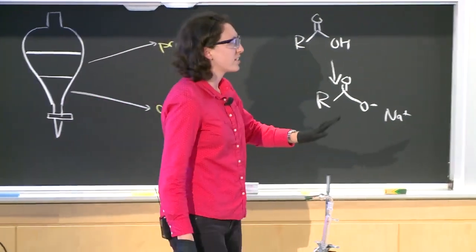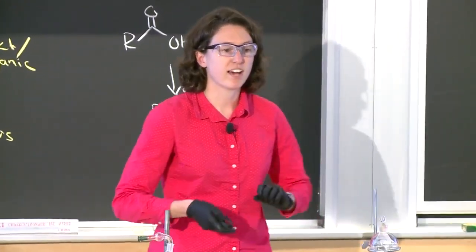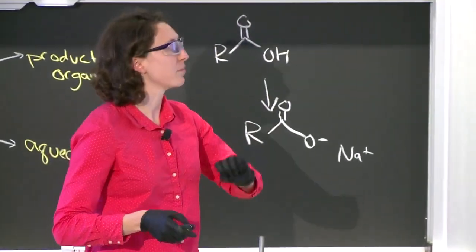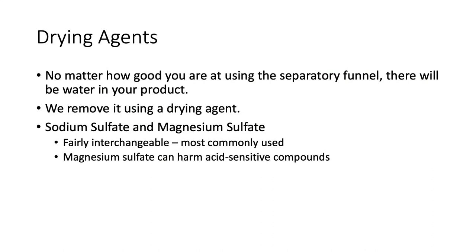So I guess we can still leave these on. So that's going to be all in day 1. You will reflux your product, then you will use your SEP funnel, you will start to purify it, and then on day 2, after you have isolated your product, we have just added a whole bunch of water to it, right? We've shaken it up with sodium bicarbonate and sodium chloride solution. We don't want water in our product. That's not the point of this.